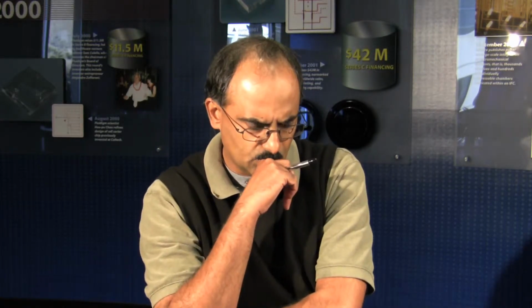Yeah, I think that helps give us a little bit of background, because the next, let's look at agricultural biotech, for example. How would this kind of genotyping be used in agricultural biotechnology today? Okay, so let's talk about why genotyping is actually important at all in agbio. It's really important to be able to track whether a plant is what we think it is, for example.